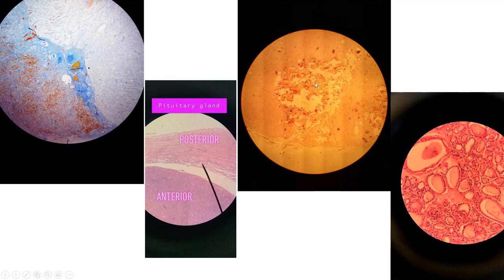Coming over here, this is actually the pineal gland. Remember, the pineal gland secretes melatonin. One of the key characteristics of it is you get these little areas in the pineal gland that look granular, a little darker pinkish, reddish color. And this is called pineal sand, and it is the big way to identify the pineal gland. So pineal gland with pineal sand, these little granules.